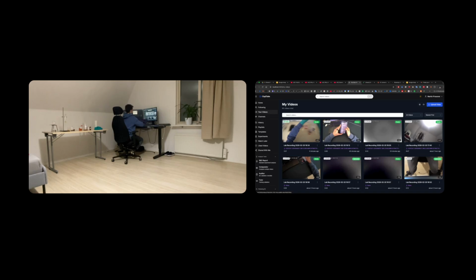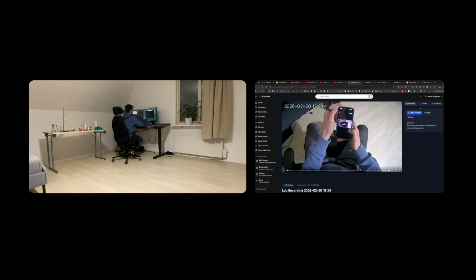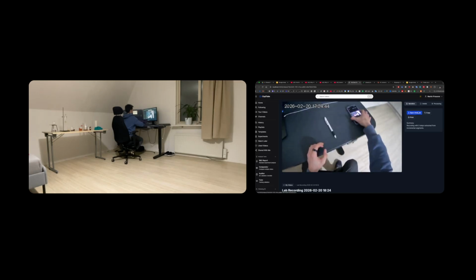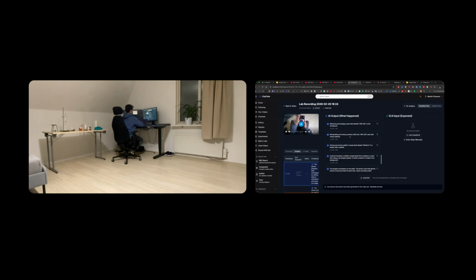Okay, the video is ready, so now we can go into the video. And then we can have a detailed breakdown of what is happening every step along the way.